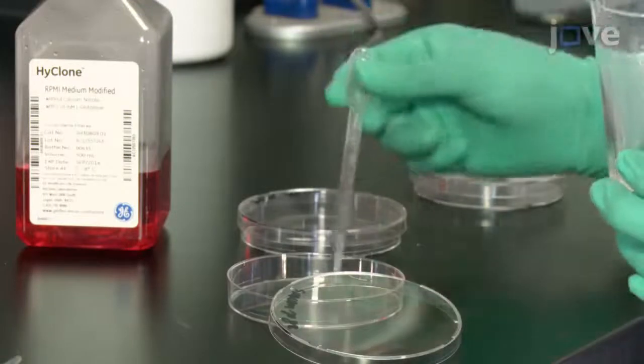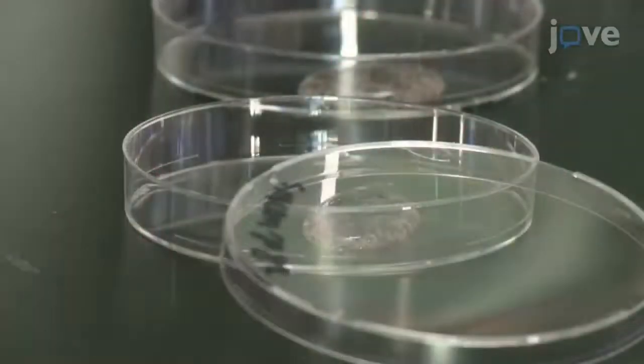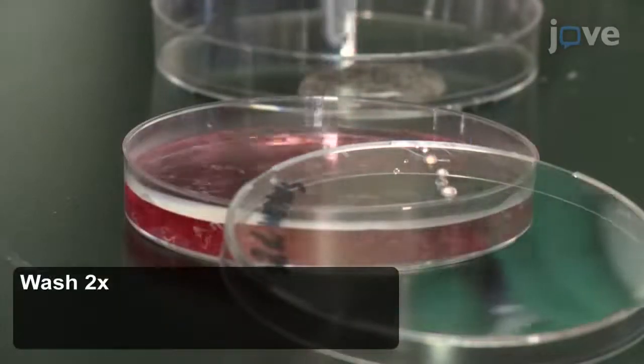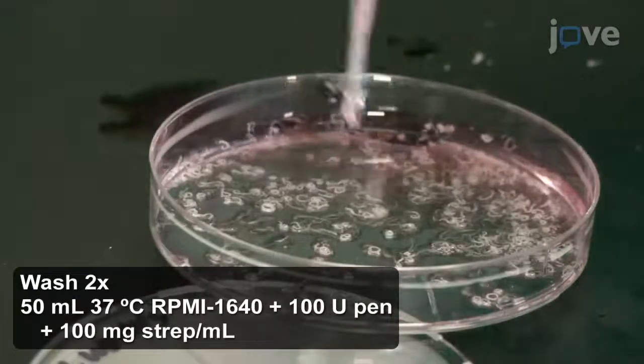Next, onto 90 mm dishes, plate about 200 worm pairs per dish. In the dish, wash the parasites twice more using gravity sedimentation. For these washes, use warm RPMI medium supplemented with PenStrep.